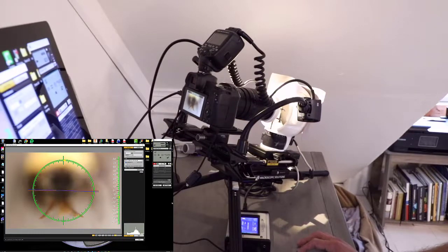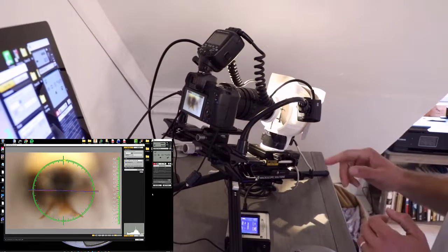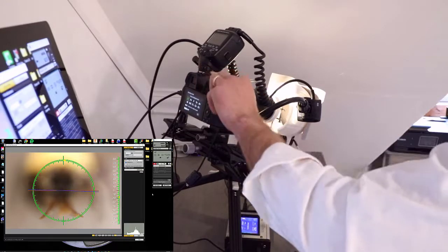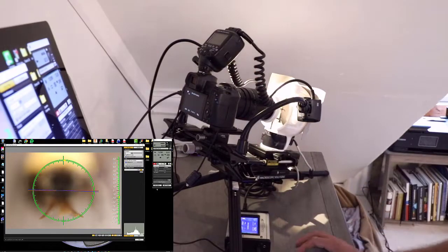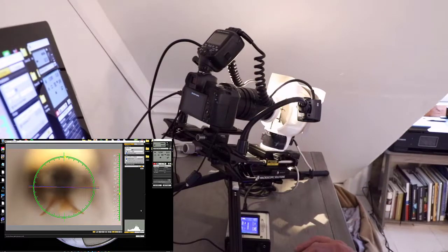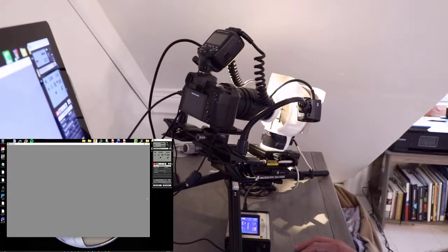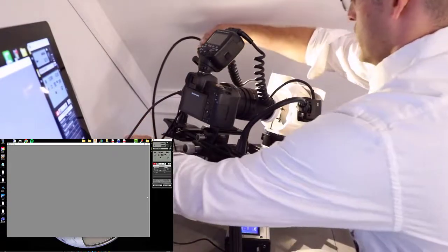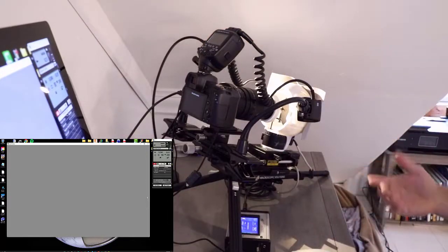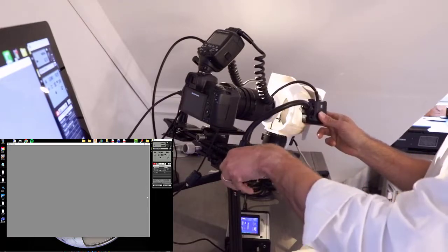Okay, the next thing we want to do is begin to set up our settings for how we're going to be taking this image. For that, we're going to take our camera setting off of automatic, and we're going to go into manual mode. The live view is going to go dark because it's not going to pick up as much light anymore. So we're going to use the quick preview window. We also want to hide any direct light that's coming from another source. Typically that's not even going to be seen because most of the light is going to be coming from our flash unit, but it's still good to hide that.